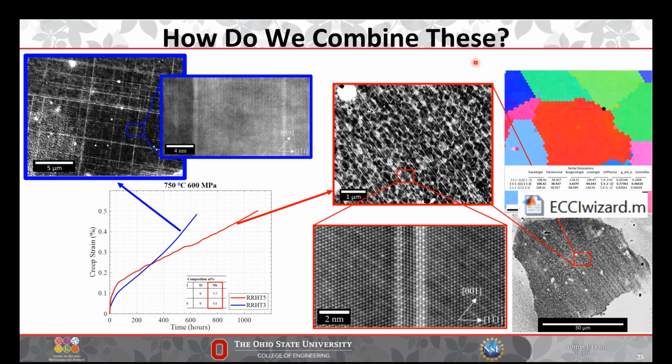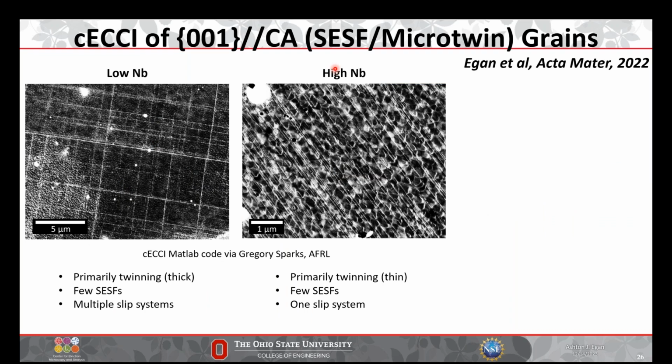And something I'll point out is the thickness of both of these defects. You can see the twins are basically different sized. And we know all of these traces are twins because I spent a lot of time going around randomly to these traces and looking at them, and they're basically all microtwins. And how do we get quantitative about this and tell us something kind of important?